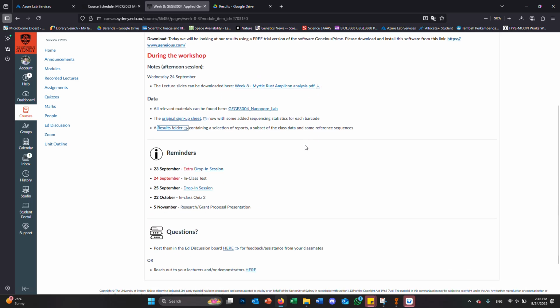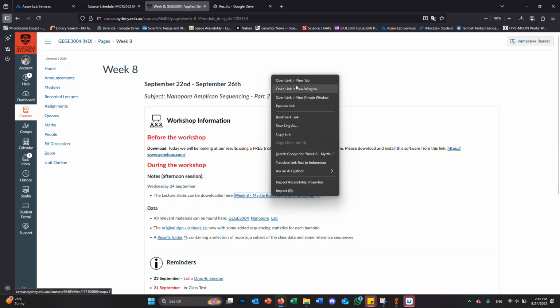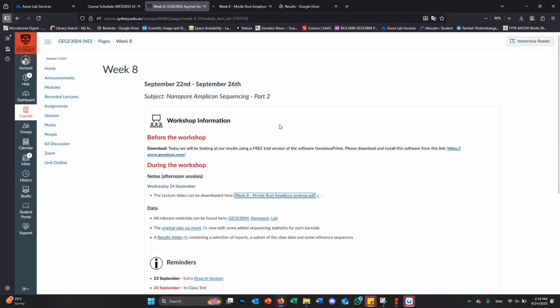That's because the flow cell itself contains these proteins. They're actually proteins that are powered by the normal cellular source of energy, ATP. And so the buffers that we put in our library have got all the solutions that are required, including ATP, and they get depleted over time. And the proteins themselves just get worn out and become less and less active. Okay? But we got a good amount of data in our 42 hours.